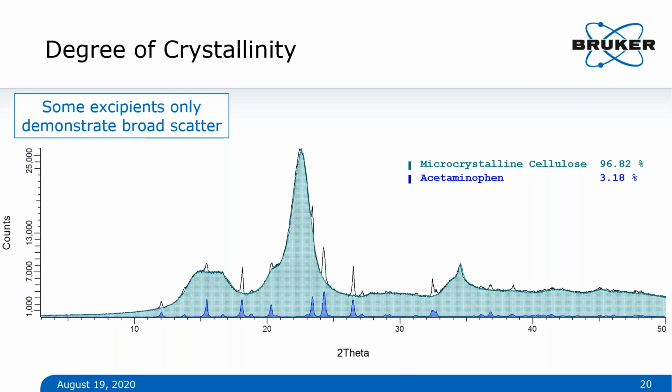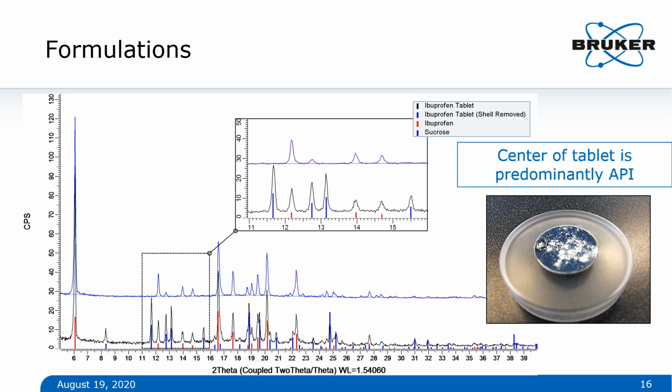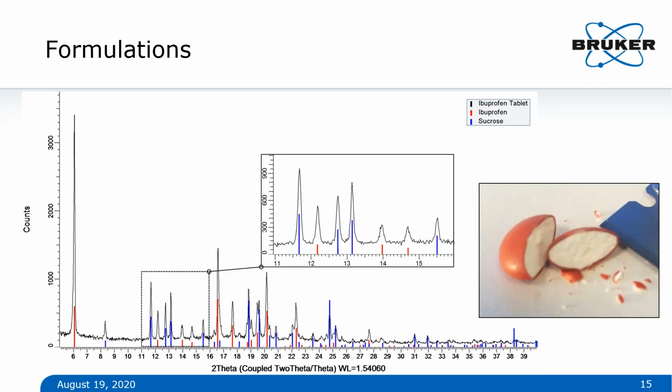So a couple of different strategies that I've seen employed within the field, and one of them is physical separation. So something like this, right? In this case, we had a physical shell, and what we did was we decided to remove it by shaving it off the outside. You could do maybe chemical separations. You could do maybe gravimetric separations.